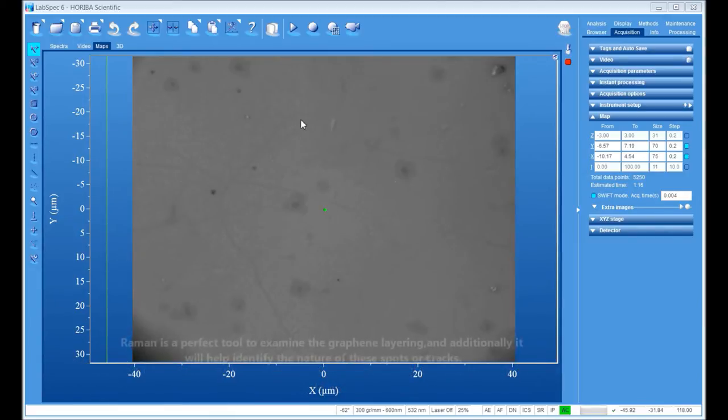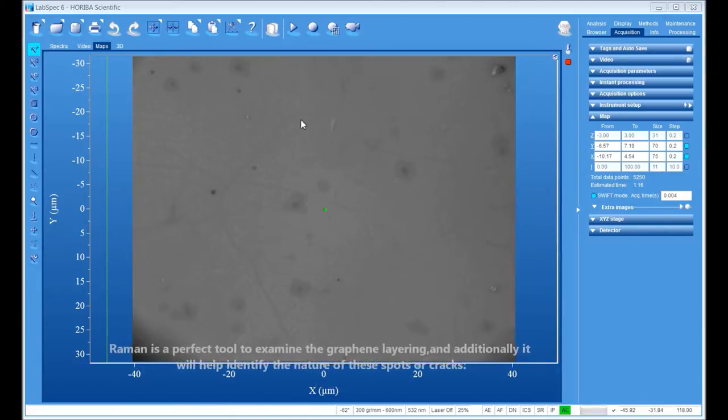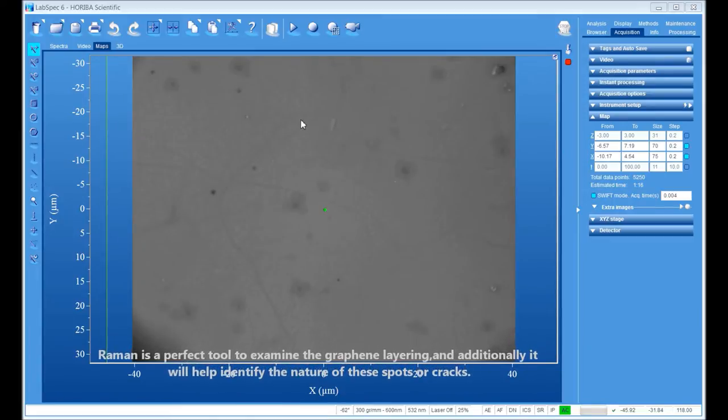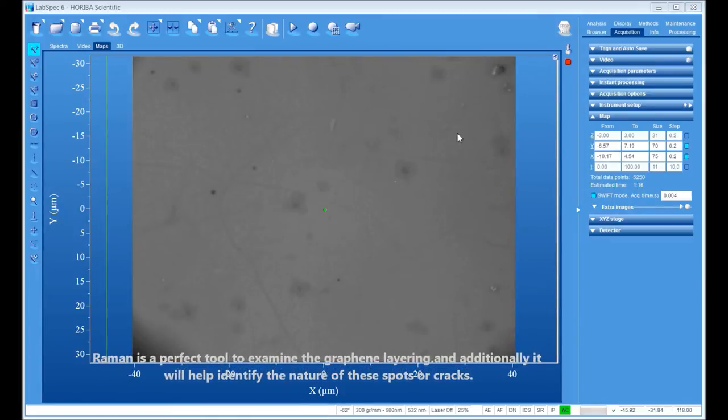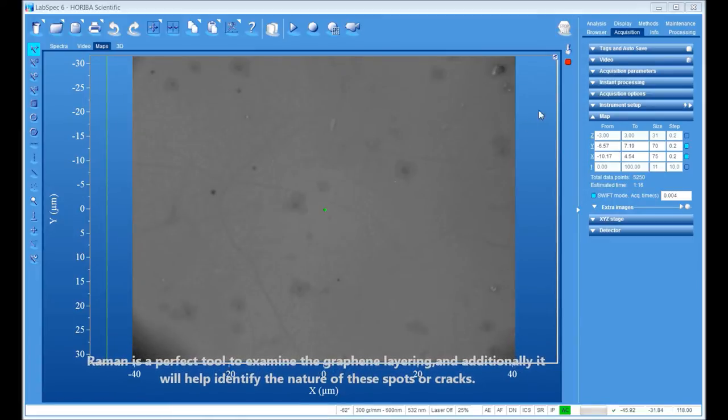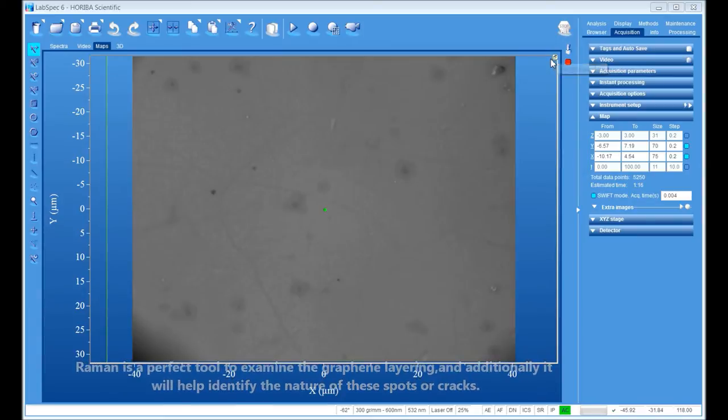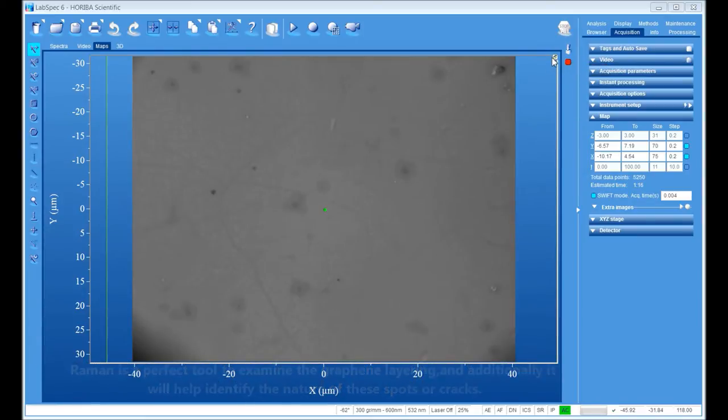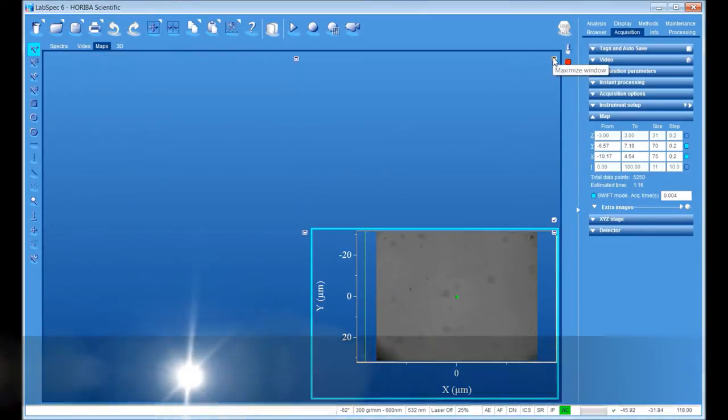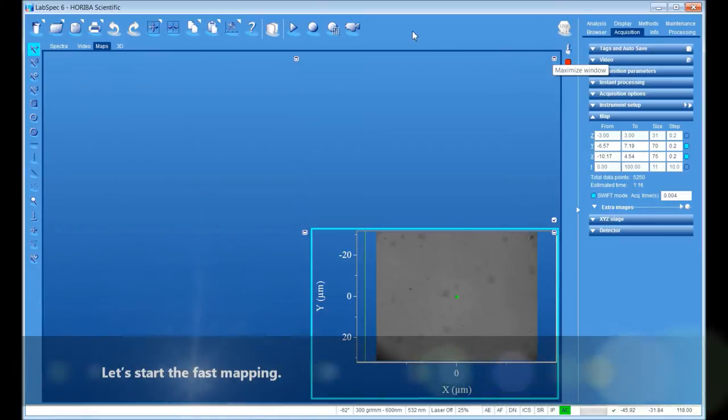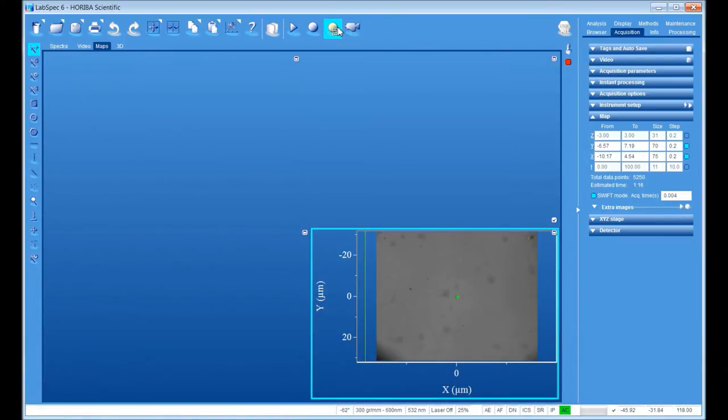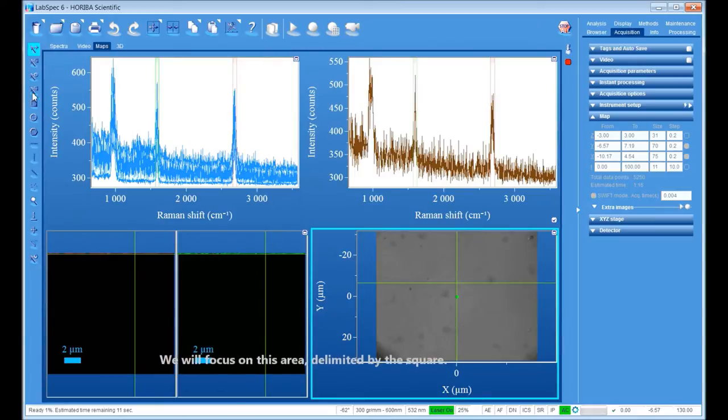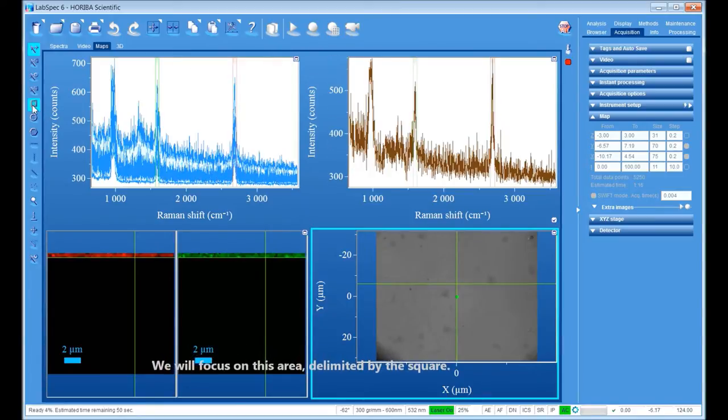Raman is a perfect tool to examine the graphene layering and additionally will help identify the nature of these spots or cracks. Let's start the fast mapping. We will focus on this area delimited by the square.